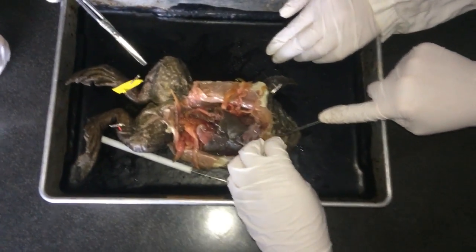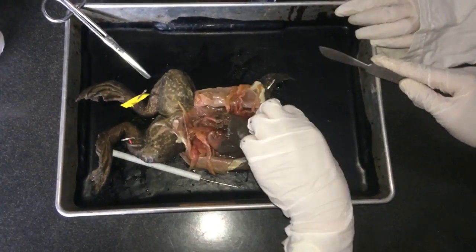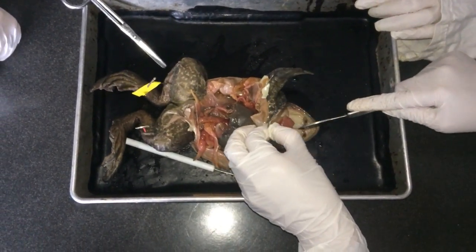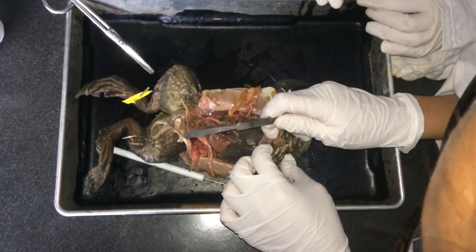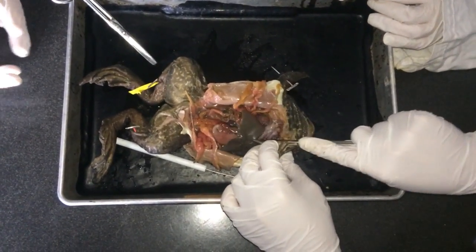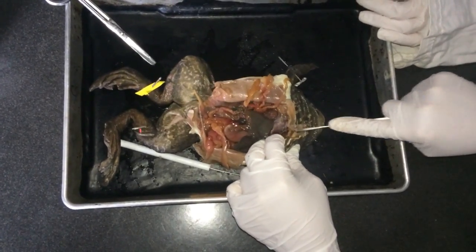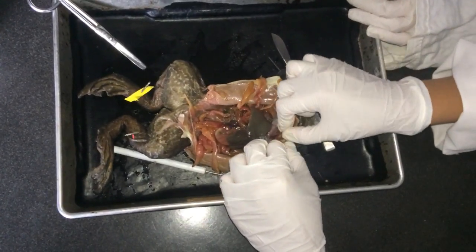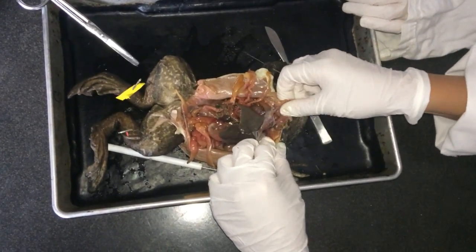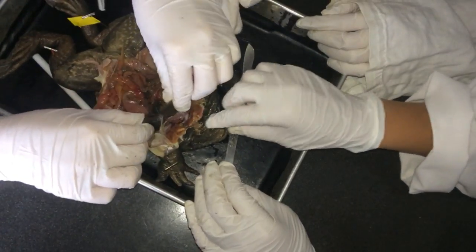Oh wow, I suck. Should we cut it open? No. Okay, that's better? Yeah. Okay.